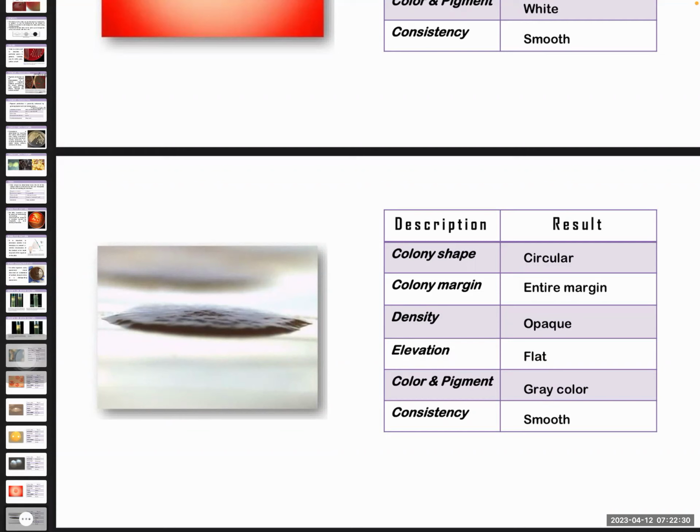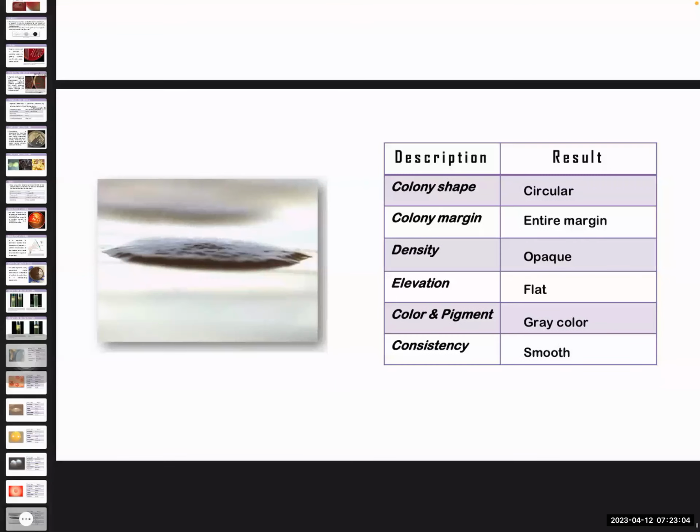So they're actually using the sugars that are present in the culture media to be able to produce their capsule because they are made out of a very structured layer of polysaccharide. And that's why we can observe a very mucoid or parang basa, no? Almost like watery, glistening type of growth because ginagamit nila yung sugars to essentially create their capsule.